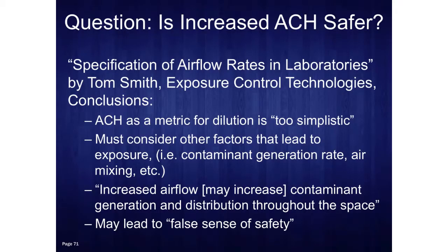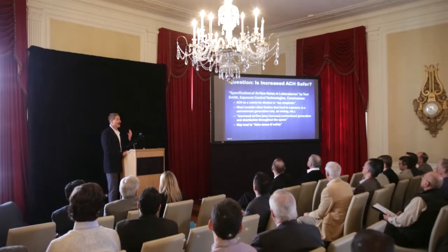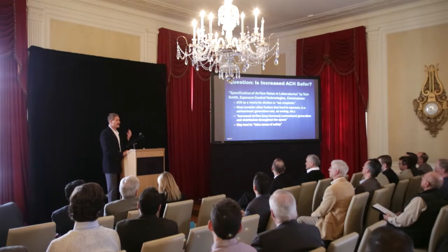So we asked ourselves, is increased air changes safer? And in an article by our consultant, who's in the room, Tom Smith, he concludes that air changes as a metric for dilution is too simplistic. We've got to look at the things we've been talking about, lab air mixing, contaminant generation.